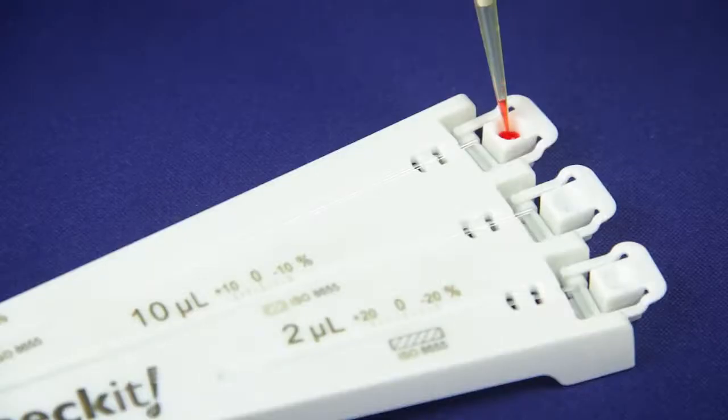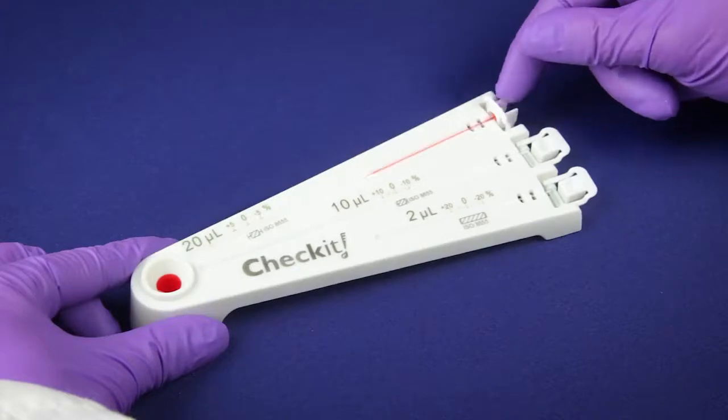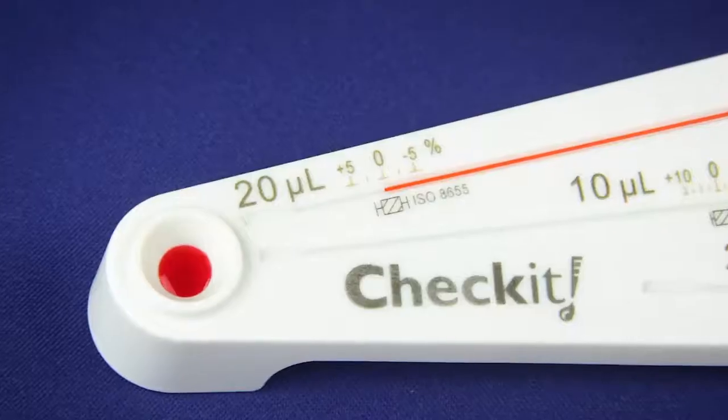Just fill it, dispense it, flip it, and check it. Verification on the spot in seconds, no matter where you are.